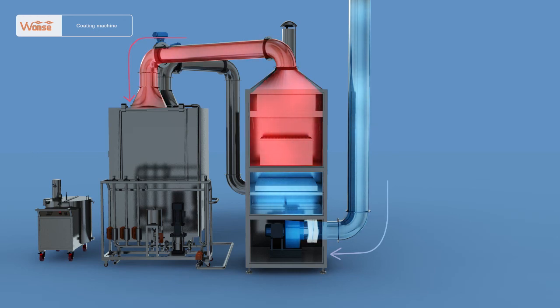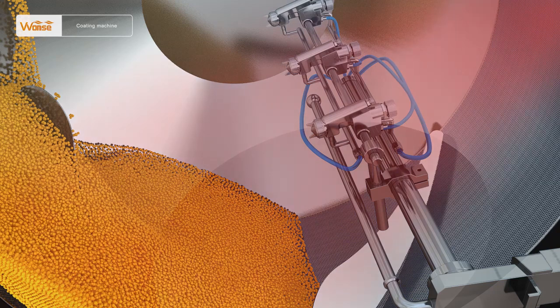After filtered by the high efficiency filter and meeting the requirements for class D clean air, the air will enter the coating drum in the main machine to carry out preheating and drying of the tablets or pills to be coated.